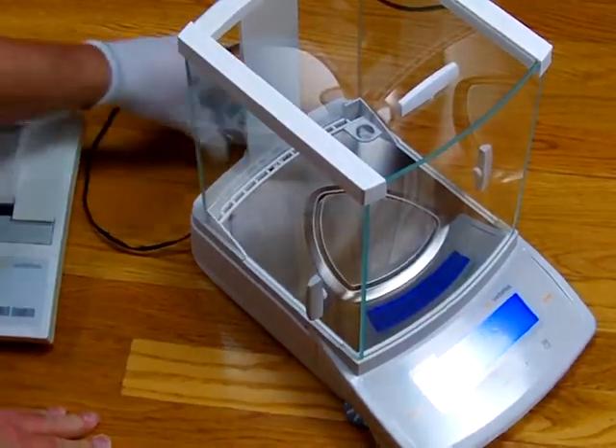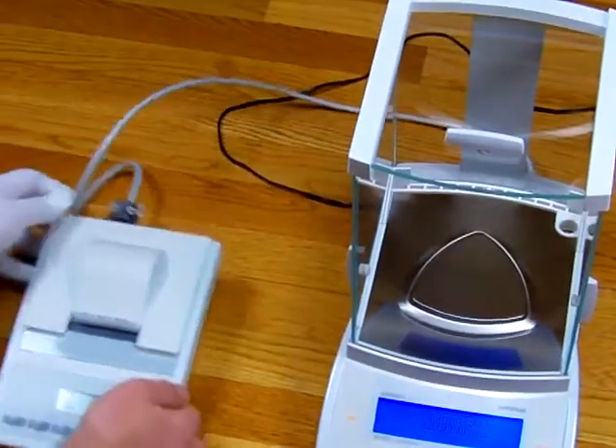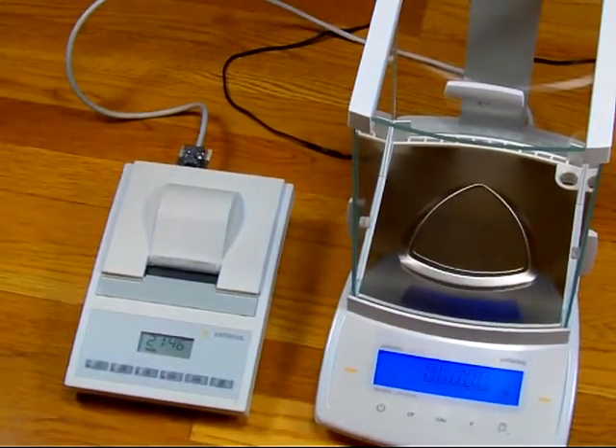We're going to plug in an external printer from Sartorius. There's a special promotion where when you buy a CPA, you get a free printer from Sartorius. We just want to show you some of the features it offers.